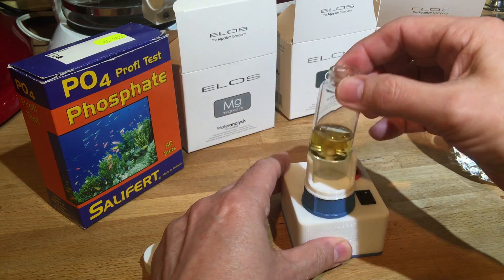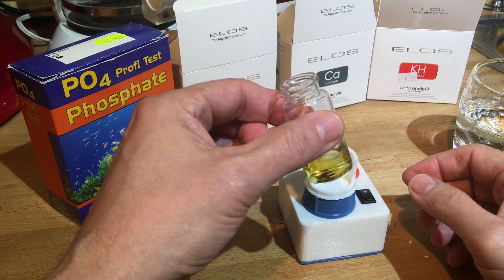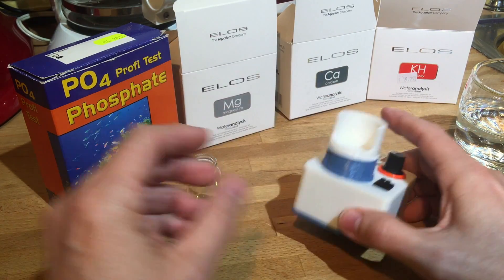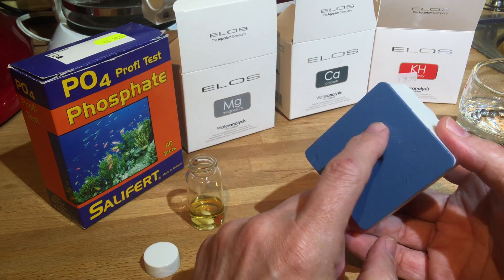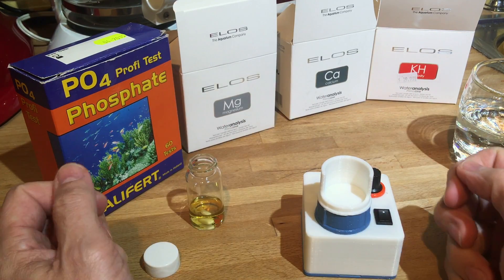We'll stop it — that was pretty easy and I didn't have to sit there and shake the vial after every drop. How cool is that? It has a screw in the bottom and when you take that off, the nine-volt battery fits inside. We'll do another test — I'm going to rinse everything out and we'll resume.